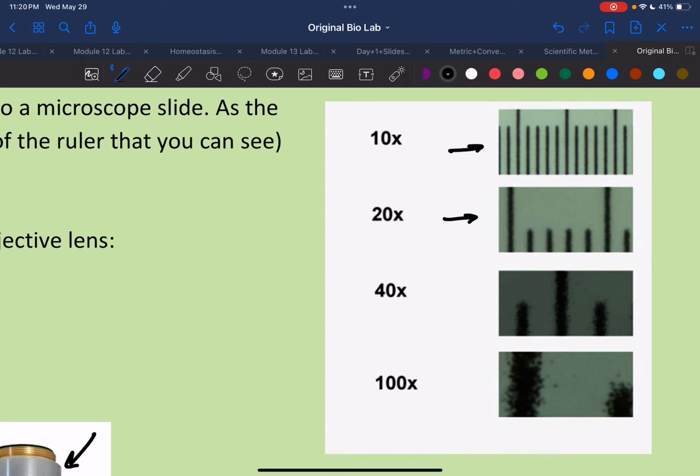So let's pretend that it zoomed in on this, right? Because I'm not moving anything. I'm just zooming in as I go. I stay in the same spot, right? So I zoom in, I get this one now, right? And then I zoom in again, then maybe it looks like I'm grabbing this one. So then I get this image, right?